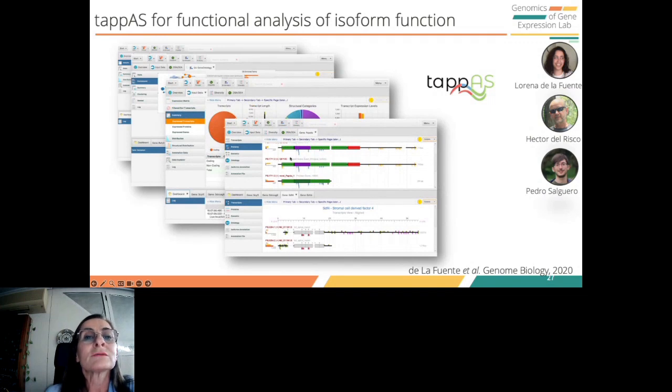We have the possibility to view the transcript structures with the annotations, both at the coding sequence for the different protein domains, but also particular sites, or even the annotation of, for example, microRNA binding sites at the UTRs. So all this is displayed here, and then of course we have the more systems biology questions.